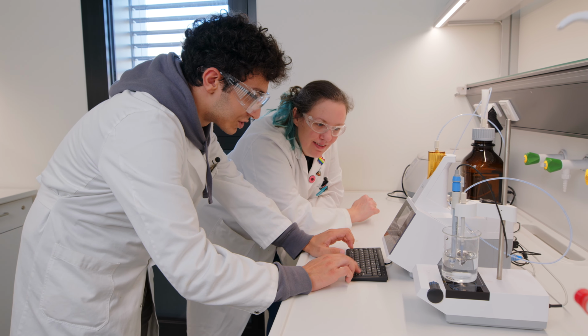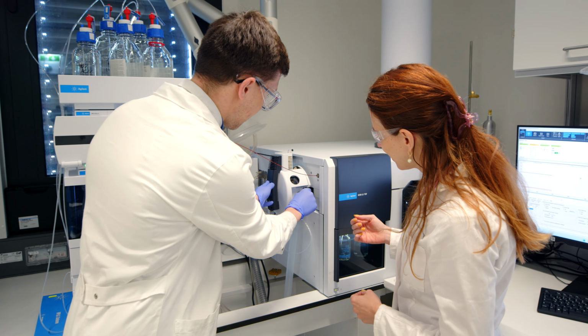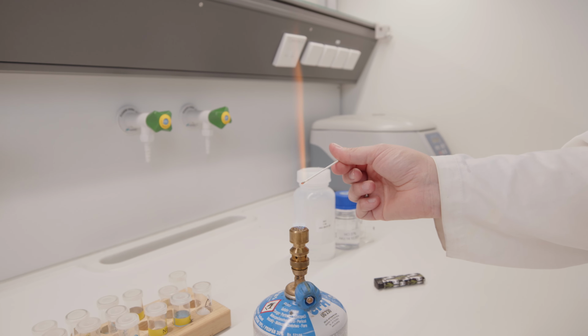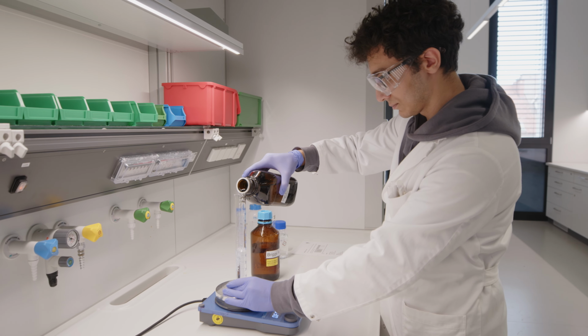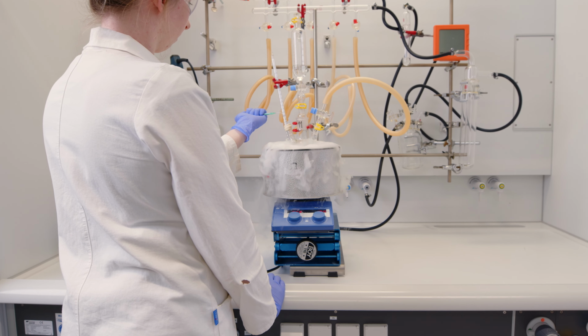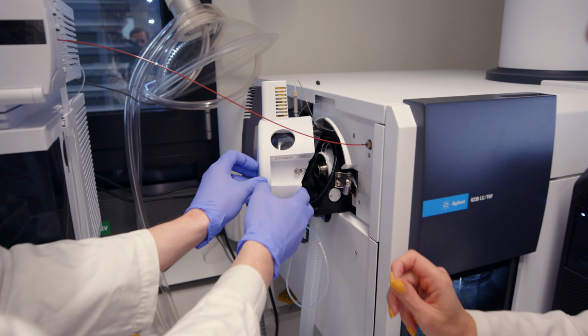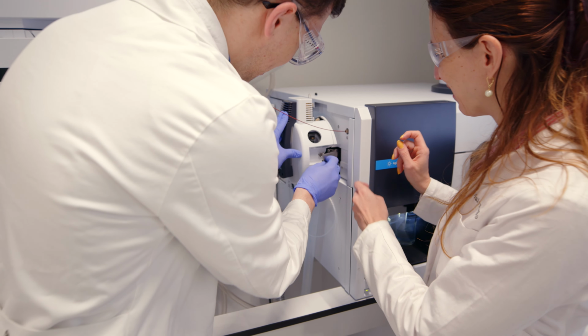In the program Sustainable Chemistry and Digital Processing, you are going to learn and experience a lot of those things related to our environment. You will get these assets in all different fields of chemistry, and our courses and lectures are organized in such a way that you see the connection between the different fields of chemistry. And that's a very important thing, because interdisciplinary thinking is a crucial asset for every chemist.